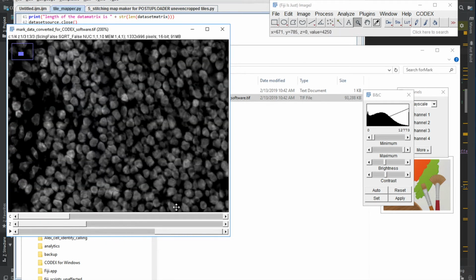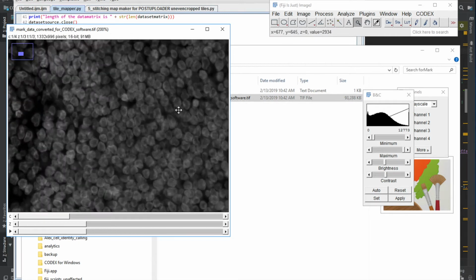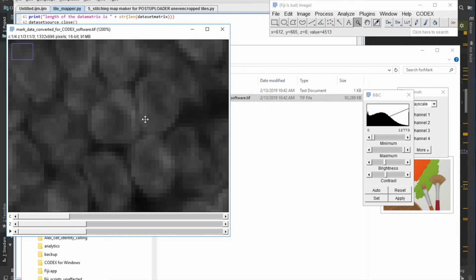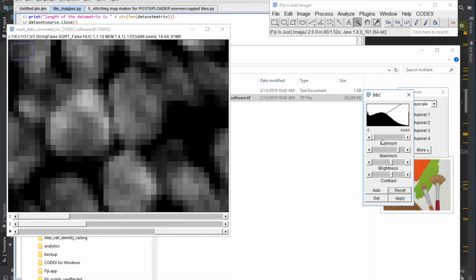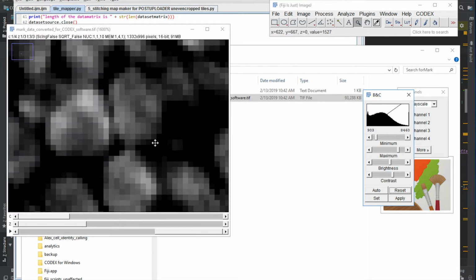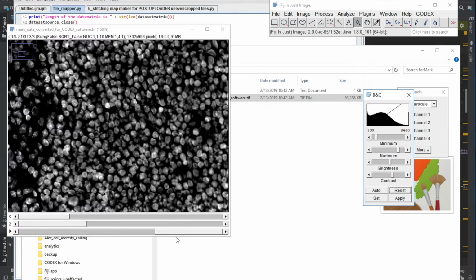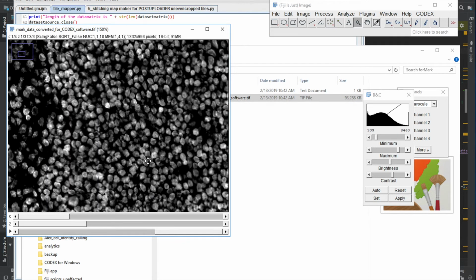What really helps, and let's look at a particular example, right? As I told you, your nuclear signal is already pretty good, but let's look at these two nuclei. They become a little bit better separated in the middle, right? So we could try to do it again and play with the coefficients. What do we have here? 3,000.